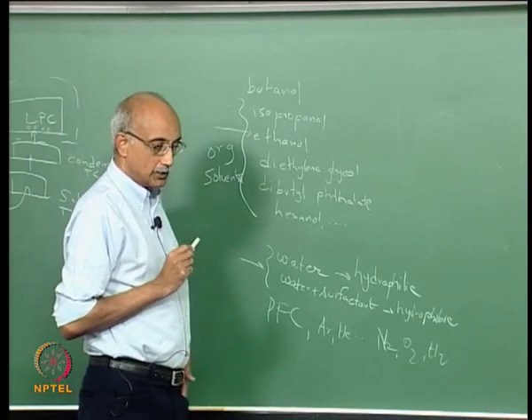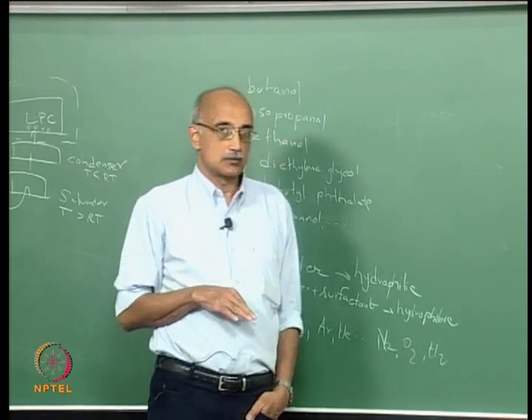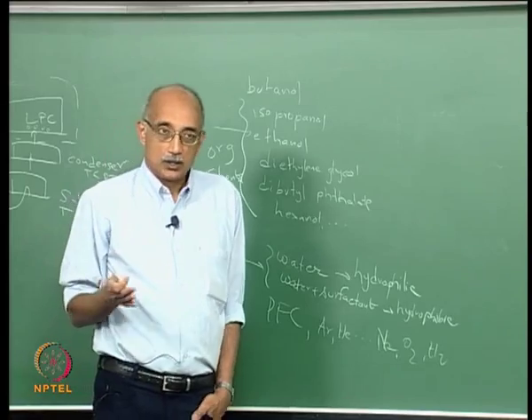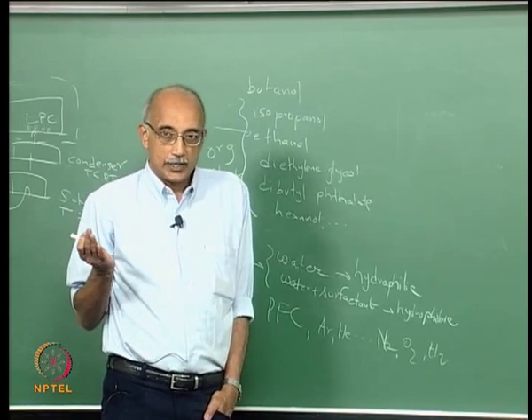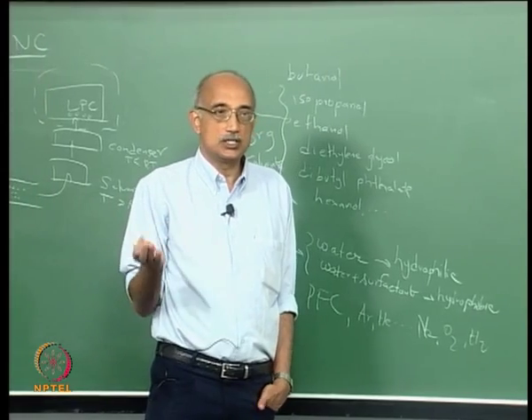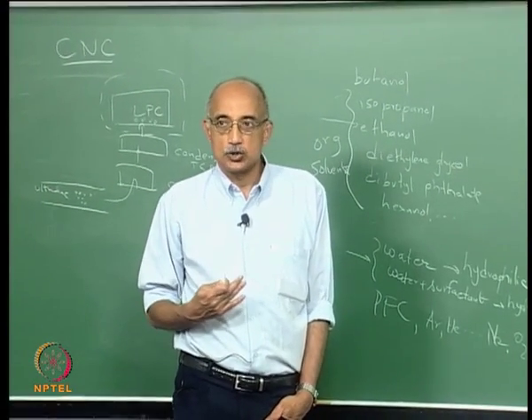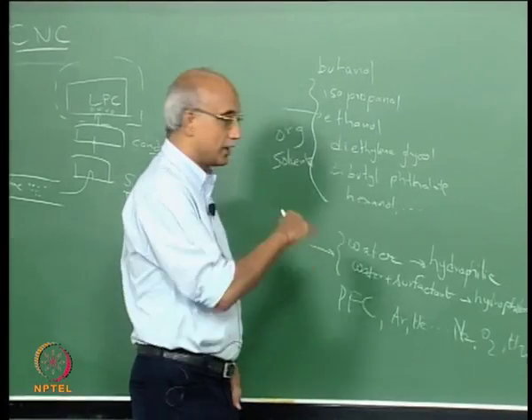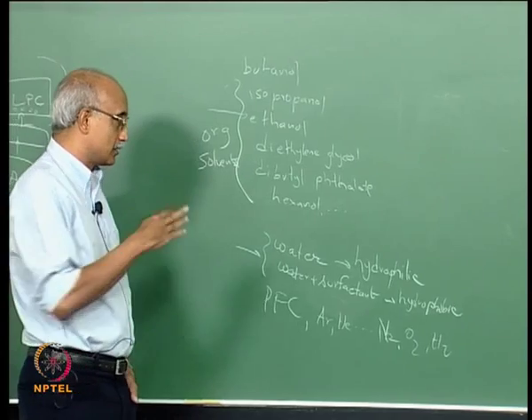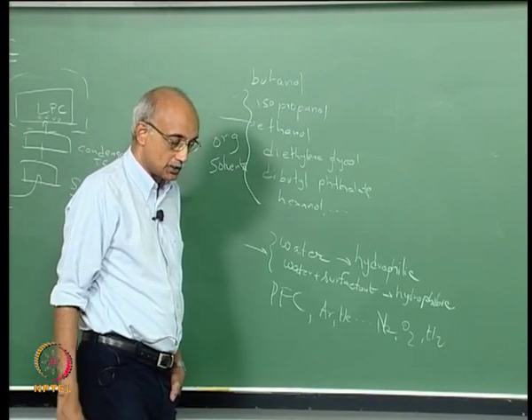The only problem with ethanol is it has beautiful properties. It has very high condensation potential and high evaporation potential. There are no toxic effects. The only difficulty with ethanol is sometimes procurement. Methanol is much easier to obtain compared to ethanol, so prices are higher, availability is lower, but you only require really small quantities to do this test. So, it is not such a big issue as far as doing this testing is concerned.